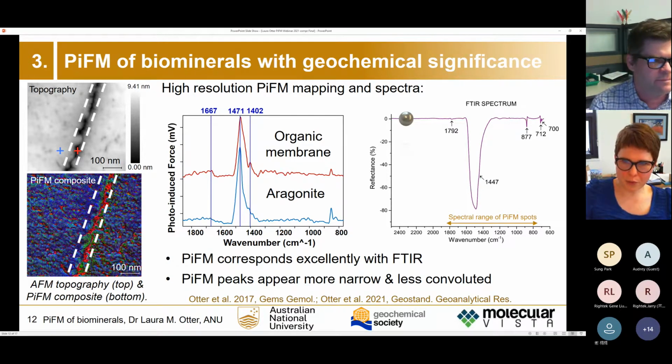Yeah, so with nacre, the c-axis is always aligned the same way. So this is basically looking down the c-axis, but the A and B axes would vary with each little platelet. And because FTIR has this huge spot size, there's a bit of averaging out between two of the crystallographic axes. I guess that's contributing to the smoothing.